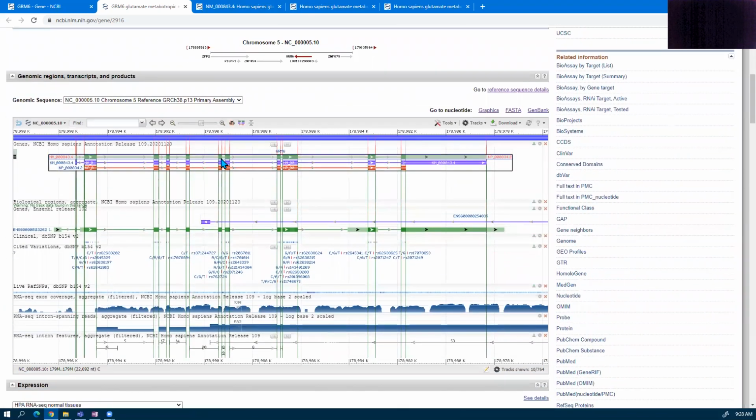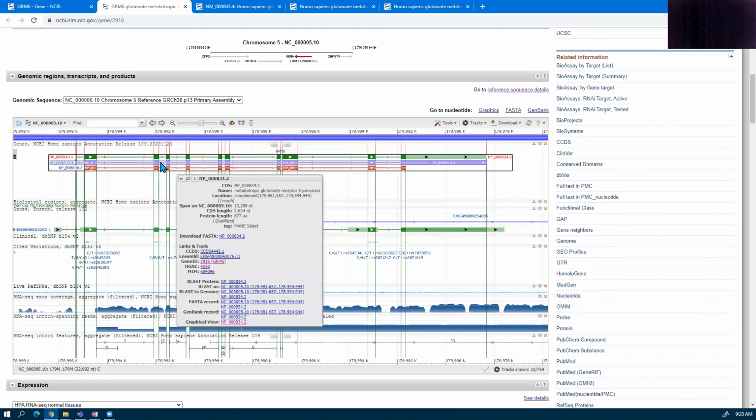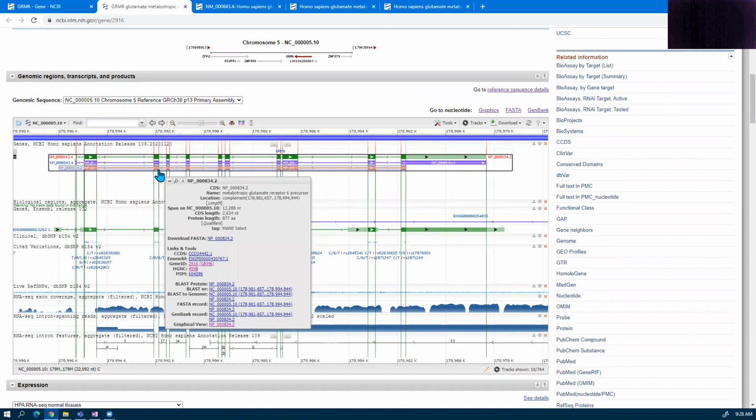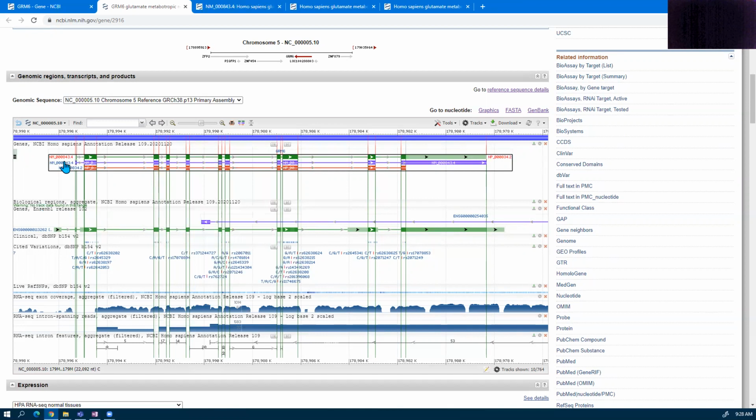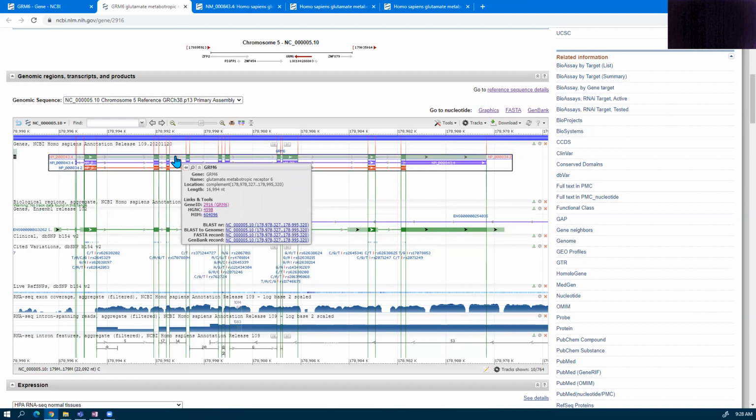And then we'll come to this graphical view, select the green line in order to expand and see the purple and the red one. So the mRNA is the purple, the reddish one is the protein sequence. This week, we're focusing on the mRNA sequence. If you also have multiple variants, then you'll see multiple green lines within this gene area of this graphical view. And if you do have multiple green lines, I want you to select the longest one and then select one additional variant as well. And we'll look into those records a little bit more.